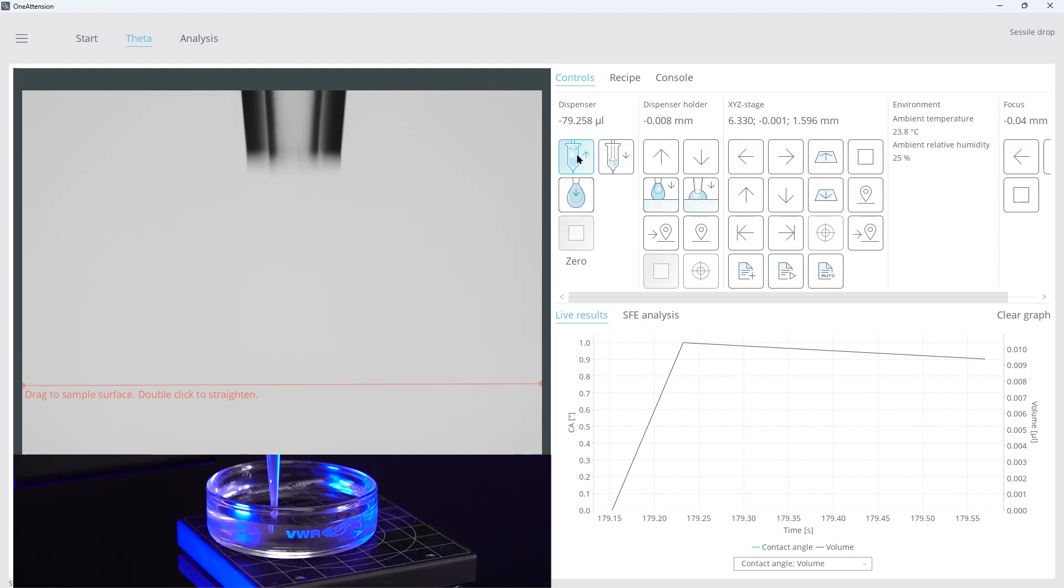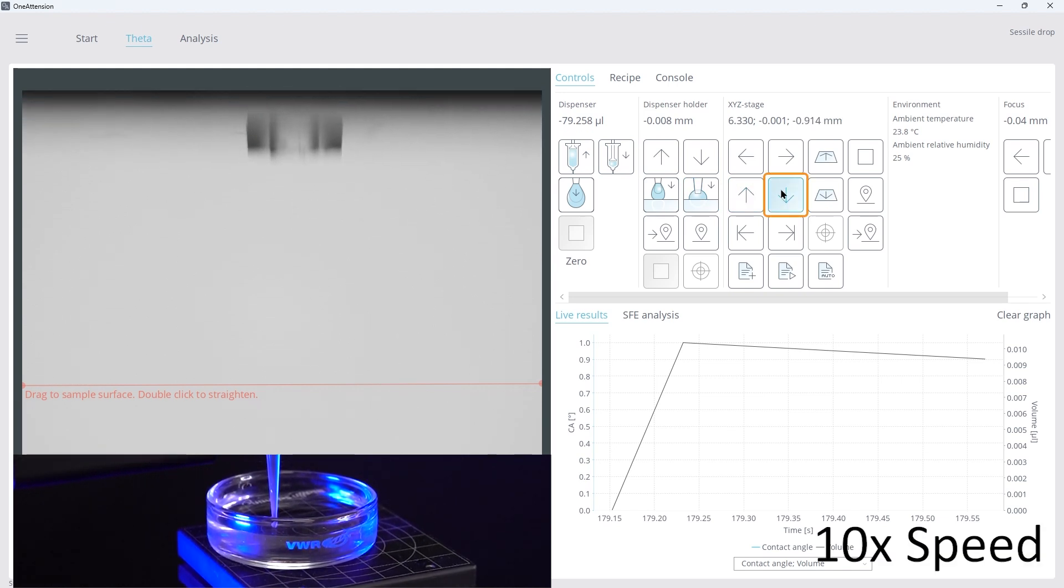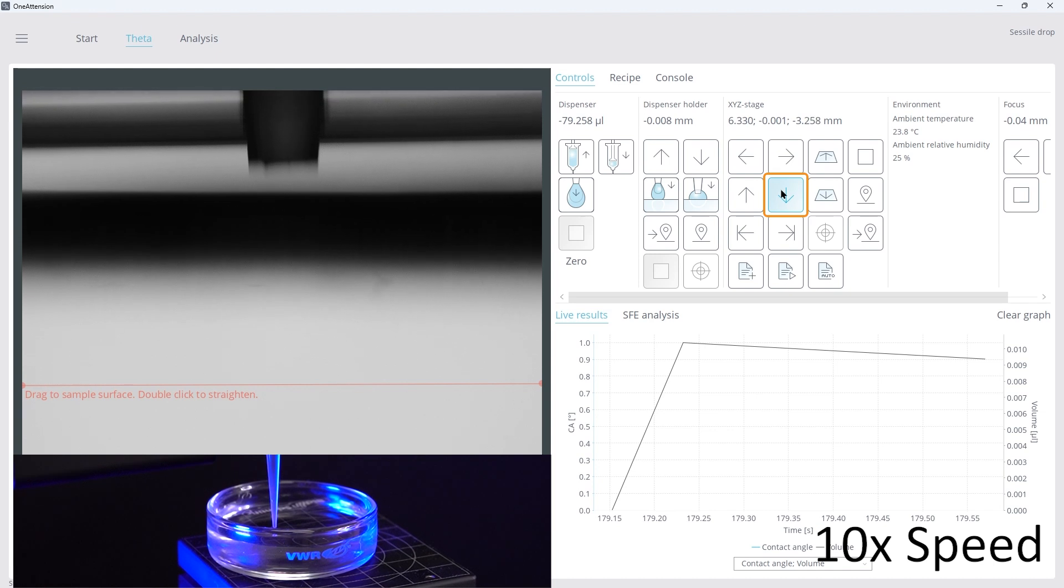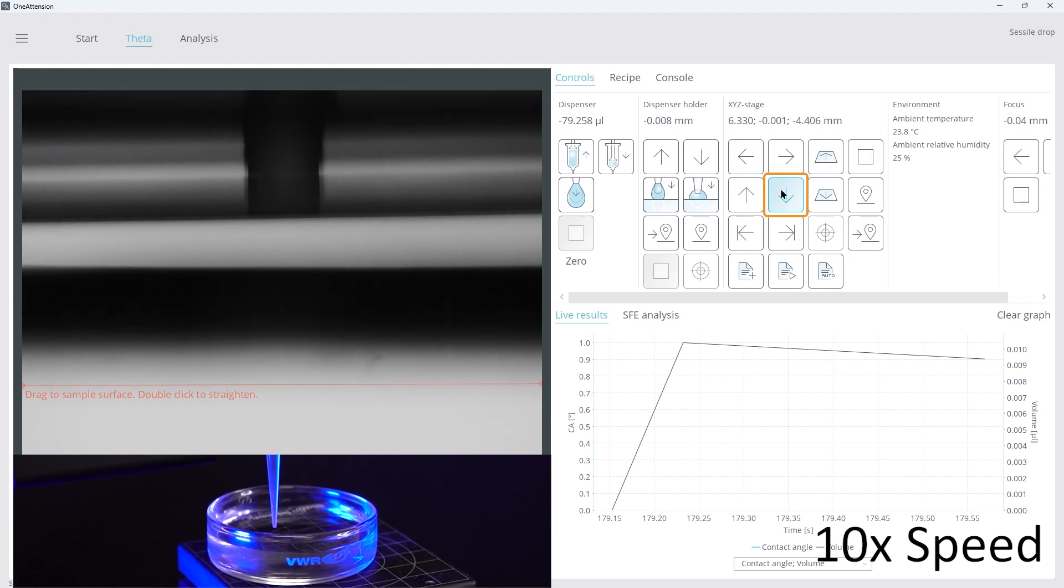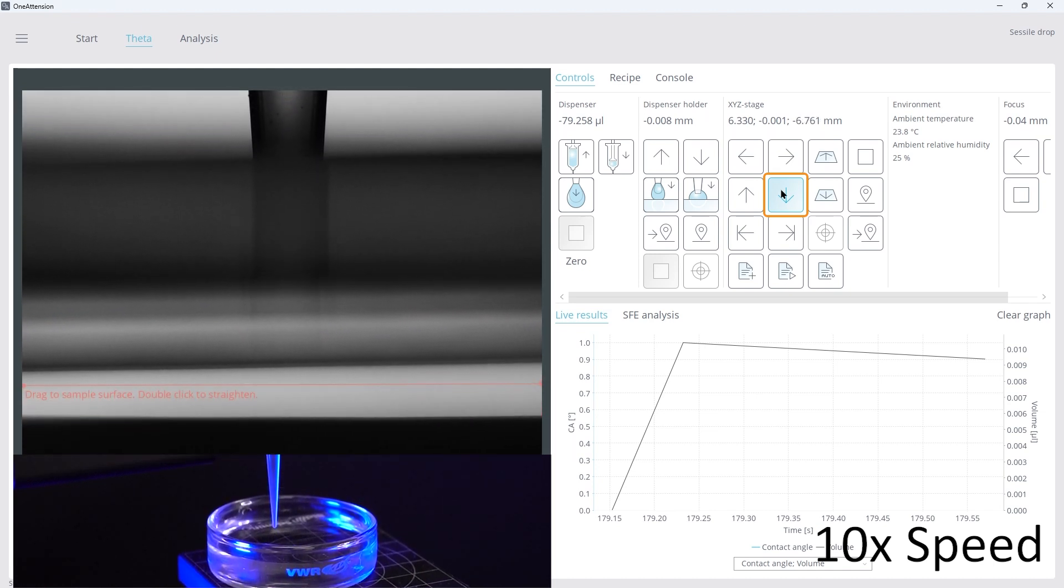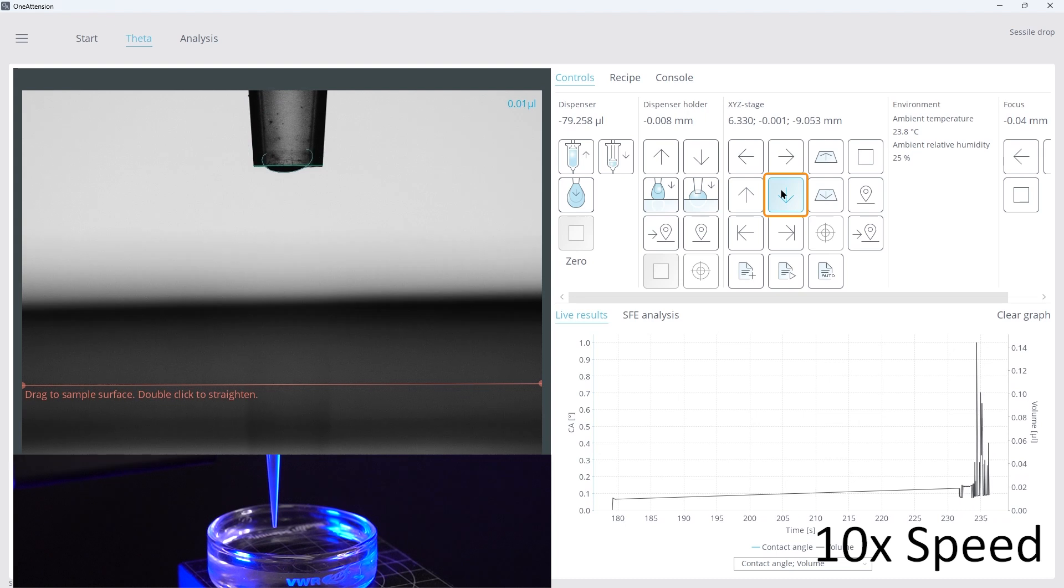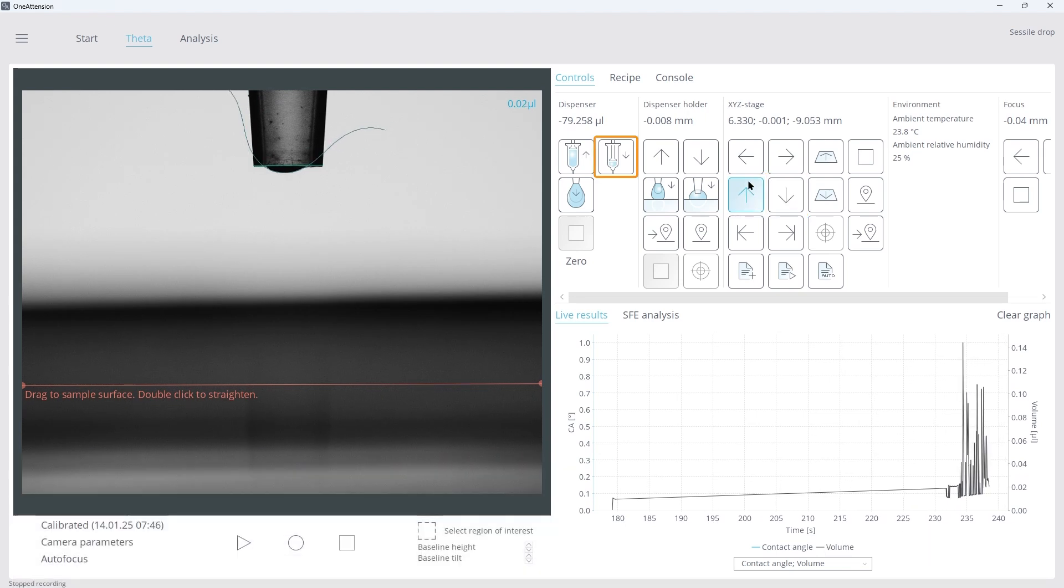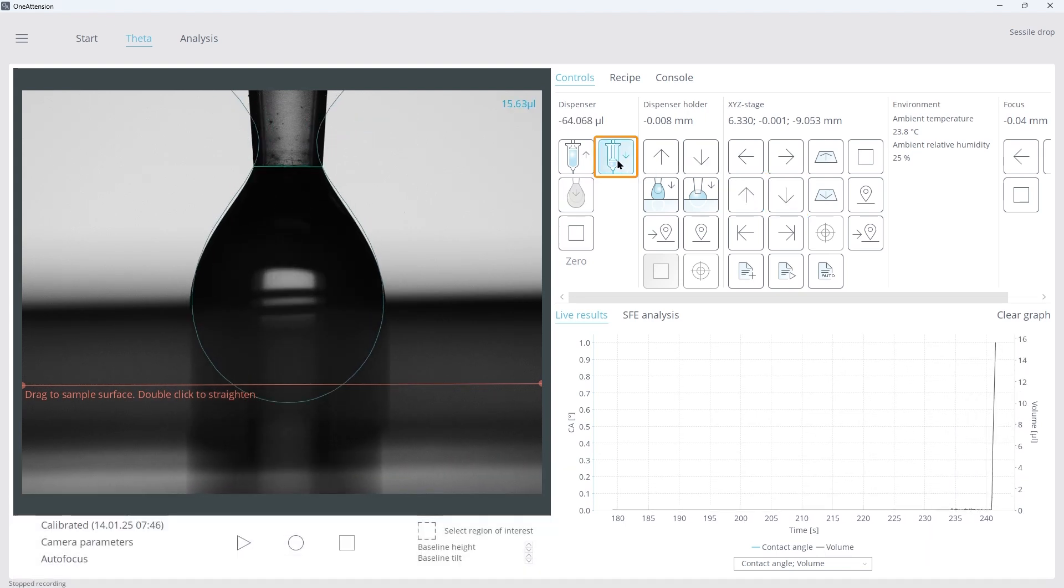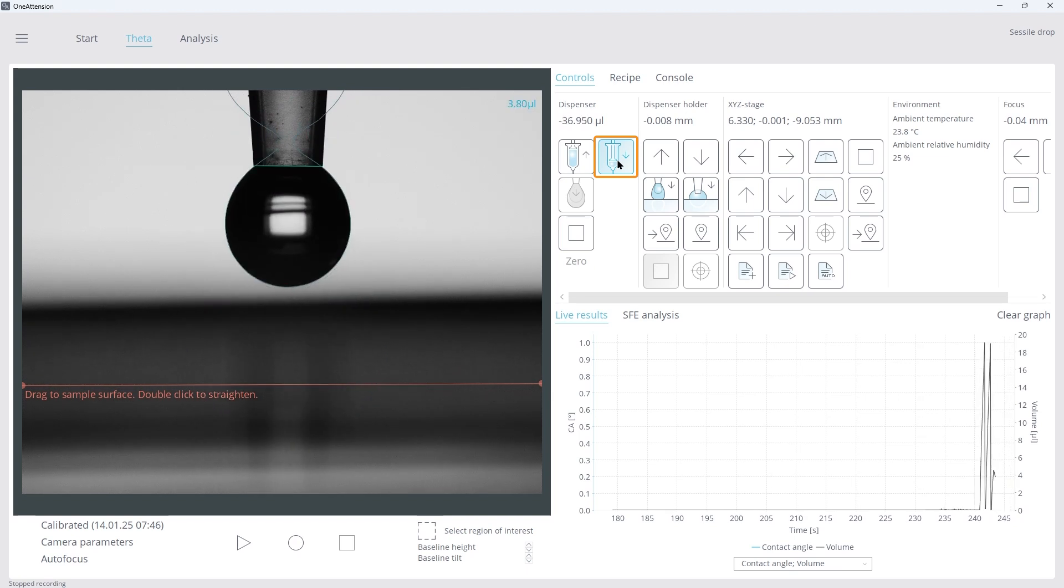Once we've drawn up the liquid, use the down arrow to lower the sample vessel enough to remove the pipette tip from the solution. Click Dispense to dispense a few droplets to remove any air that might be at the tip of the pipette.